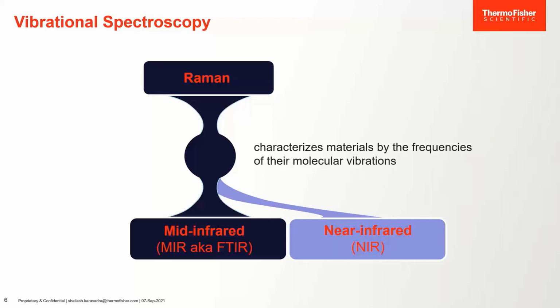In a nutshell, we can say that infrared and Raman spectra provide complementary information, and between these two techniques, all vibrational transitions can be observed.